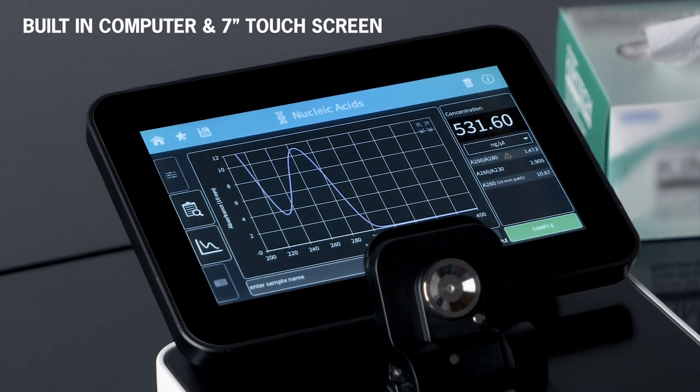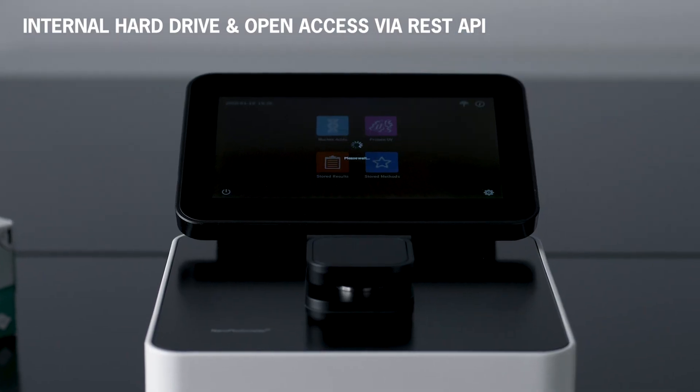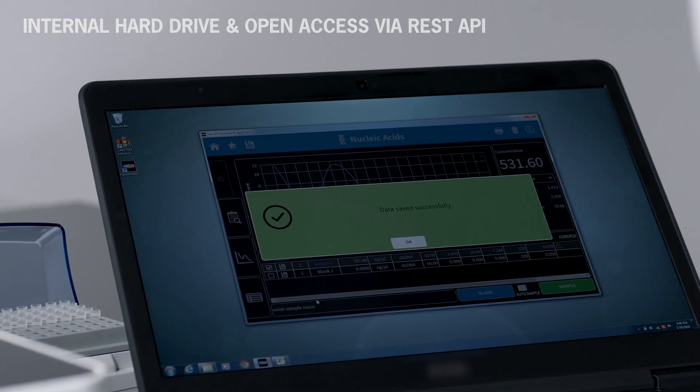It also has a built-in computer and 7-inch touchscreen. It even includes a hard drive for storing and managing data, and a web application server to transfer files to a network or external computer.